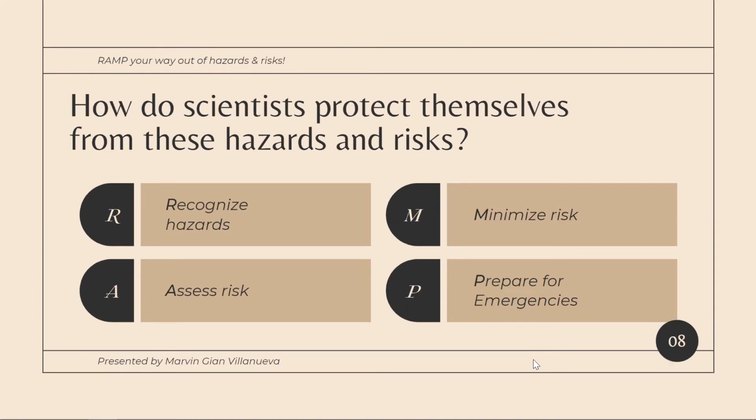With the use of unbiased, accurate information from reliable sources, such as experienced researchers and or safety experts, determine the risk of present physical and chemical hazards, then rate and evaluate them by their impact to personal safety, resources, work performance, property damage, and reputation. Assessing risk in relation to a specific experiment a scientist is about to do leads to appropriate strategies for the next step, which is minimizing risk.